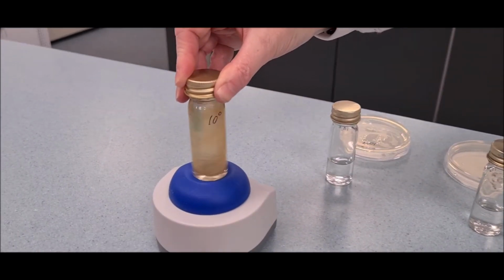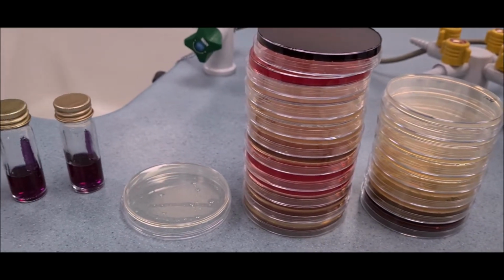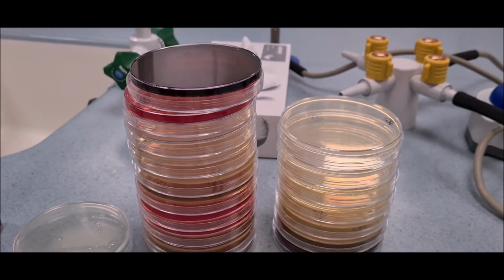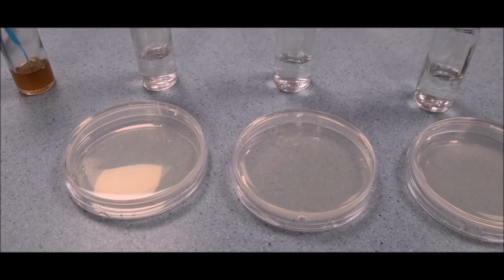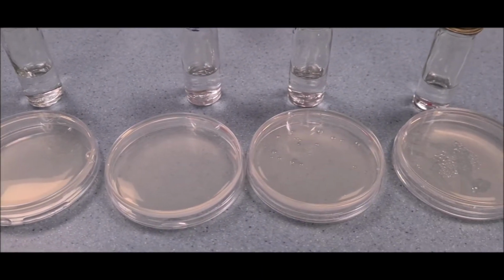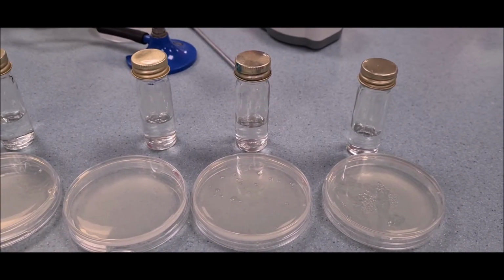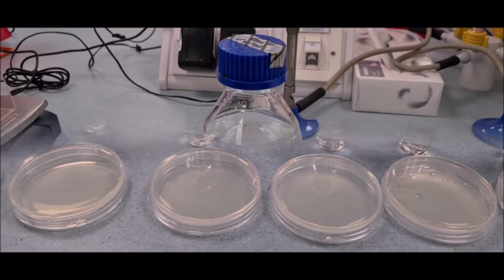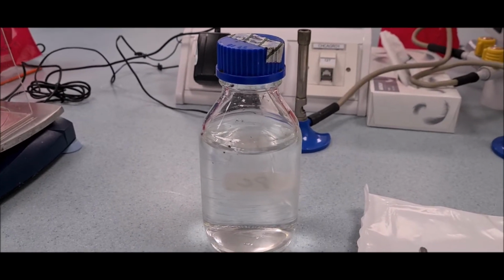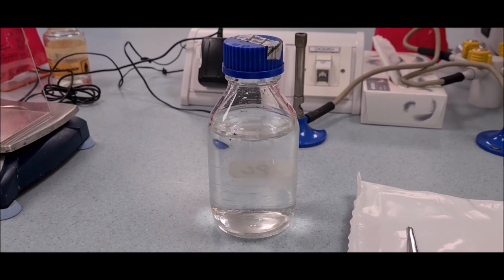vortex mixer, various selective and differential media plates. A non-selective media, plate count agar, used for total viable count or aerobic colony count. 9 ml Ringer's solution in dilution bottles. 250 ml Ringer's solution for diluting the food sample. Salmonella 1 broth for Salmonella enrichment. Listeria 1 broth for Listeria enrichment.